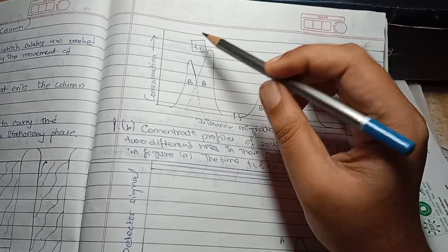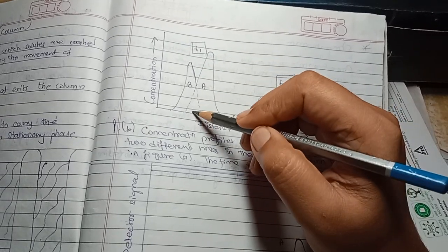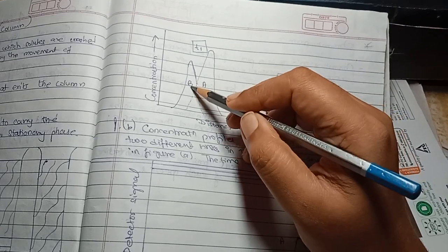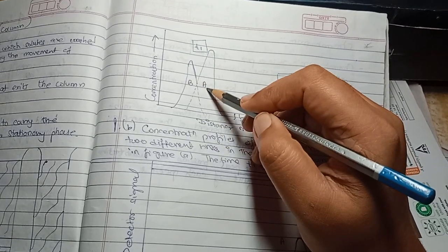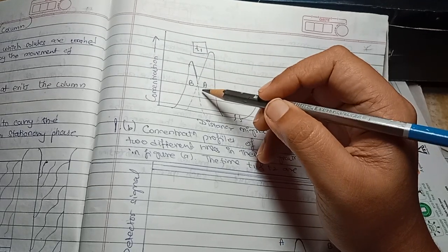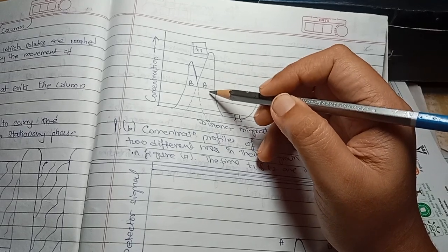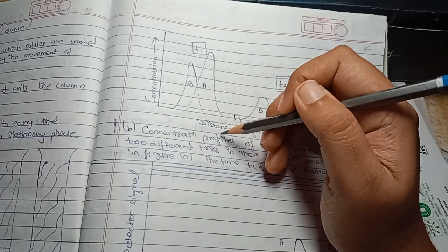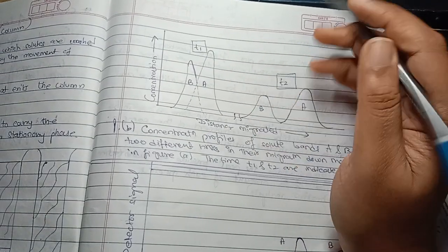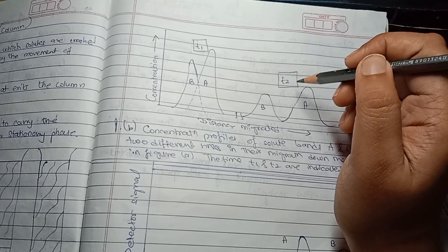What we can observe is that at the time t1, meaning at the initial timing, both A and B were mixed together. So at time t1 it was not separated. Both these components were together as a mixture of components. Then after some time, A and B started to separate from each other.